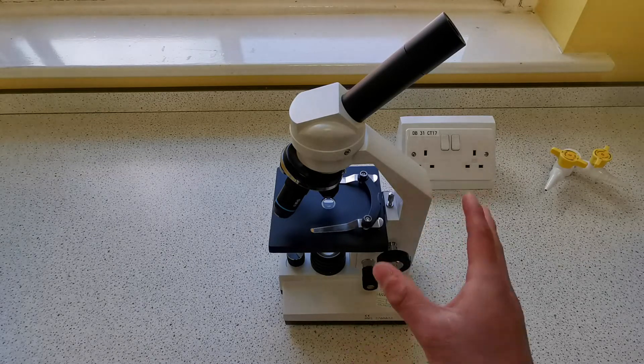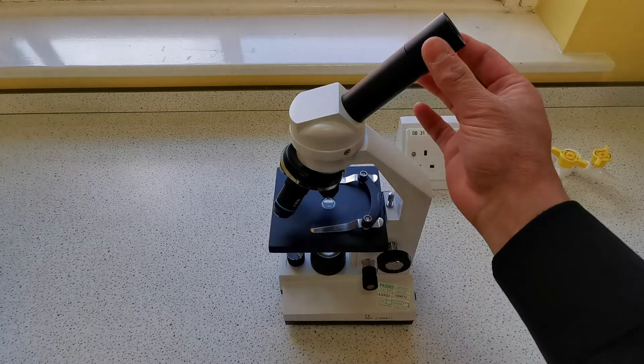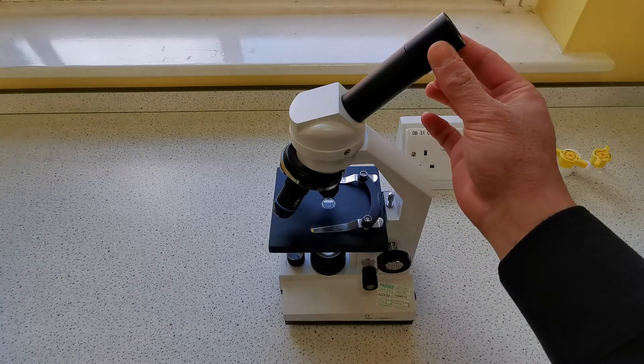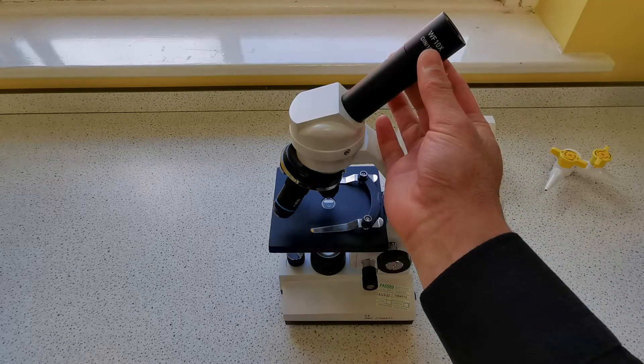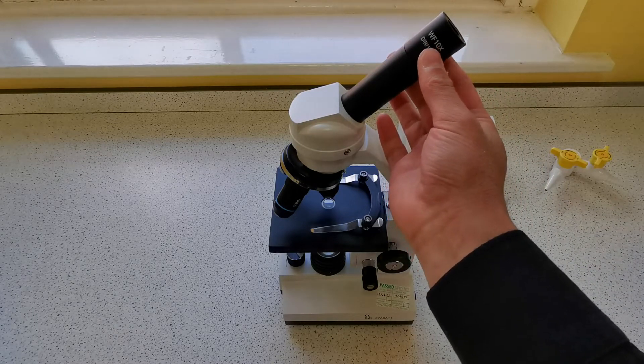In terms of the structure of the light microscope, at the top we have the eyepiece lens — this is what you look through. These come in different magnifications; as you can see, this one has a magnification of 10 times.